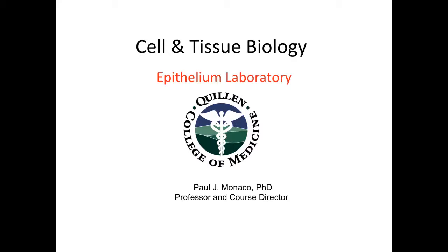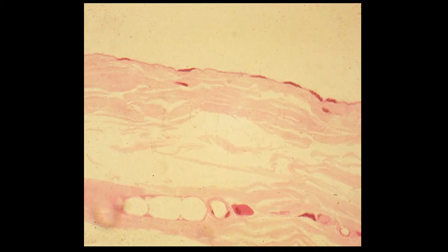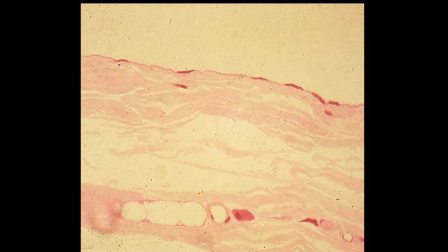This will be our epithelium laboratory. And this first slide shows simple squamous epithelium shown by these flat cells near the surface.